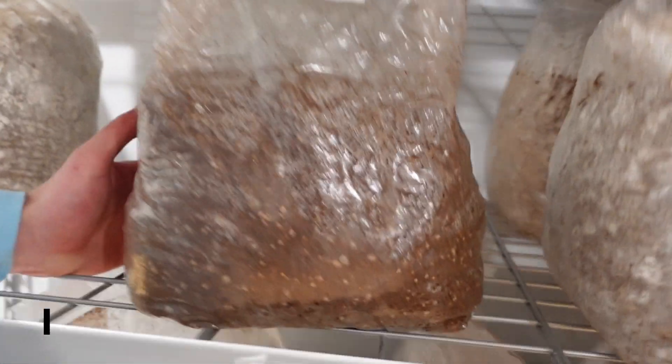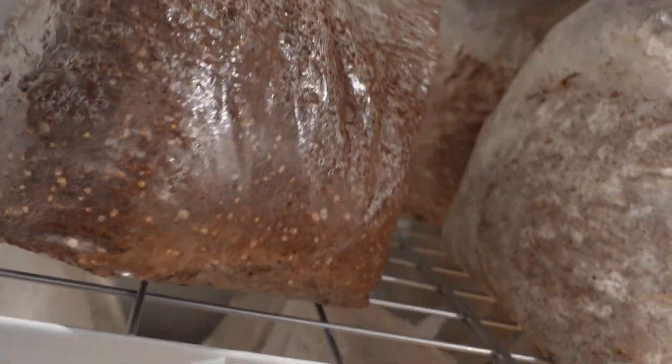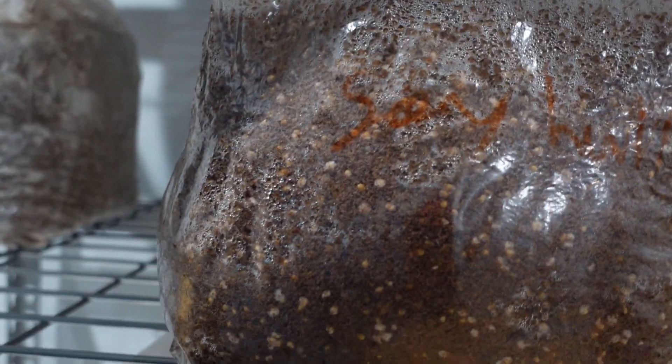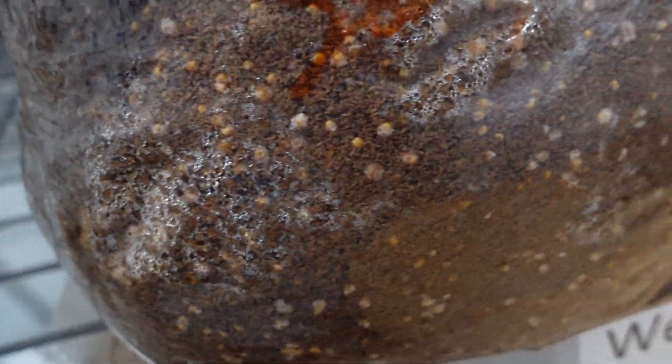So it's been two days. Here's our block that we inoculated two days ago, and it looks like, from what I can tell, there is no contamination visible — I can't see any right now. It just looks like the pink oyster mushroom mycelium is blasting off of the spawn, as I expected.